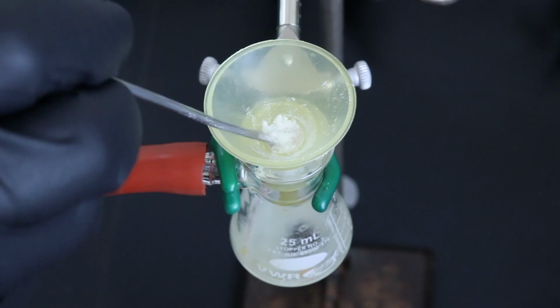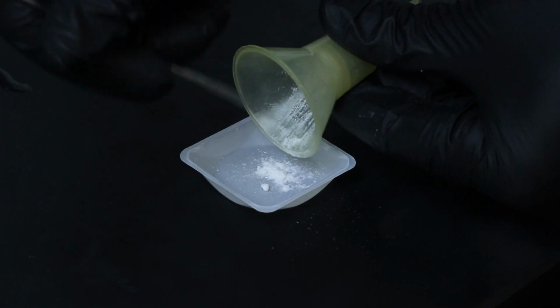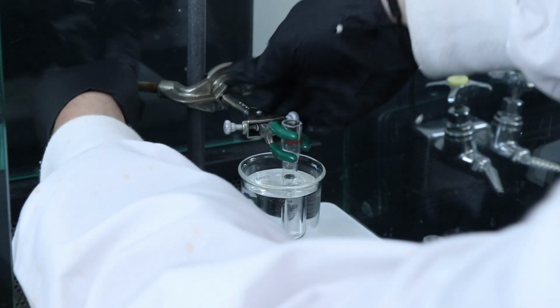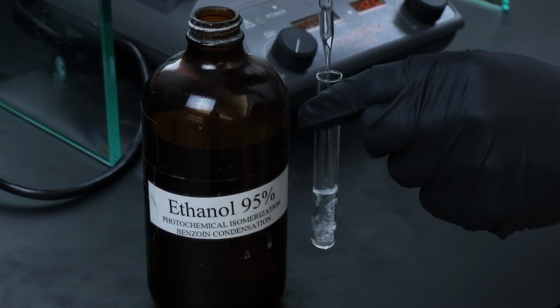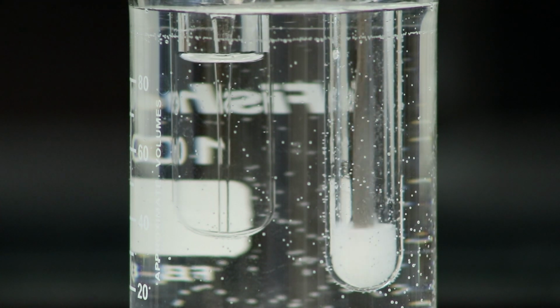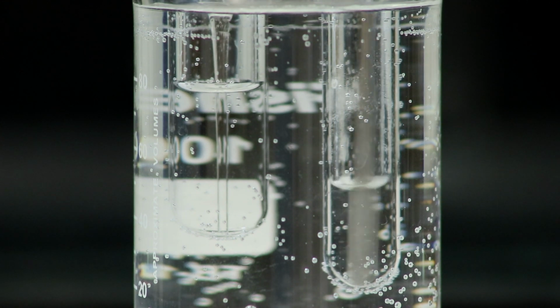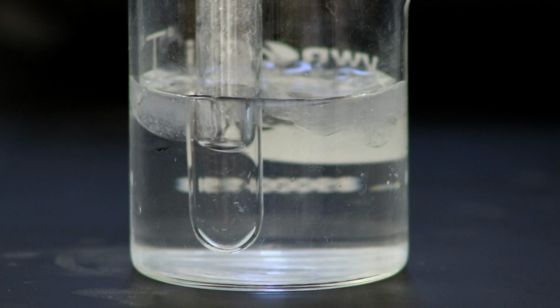After a few minutes, the product will be sufficiently dry to take out of the Hirsch funnel and then transfer over to a Craig tube to start the recrystallization process. I'll be using 95% ethanol as the recrystallization solvent, so I'll place that in the hot water bath and start adding it to the Craig tube to dissolve the product. Once it is completely dissolved, I'll transfer it to an ice bath to make sure that the solid product can come out of solution.